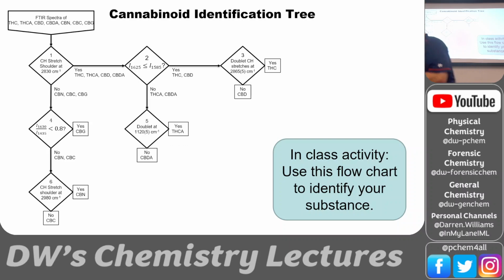And so I've got spectra for you guys. I'm just giving these to you randomly. So you have spectra of three of these compounds, and you get to use the tree up there and figure out which one it is.